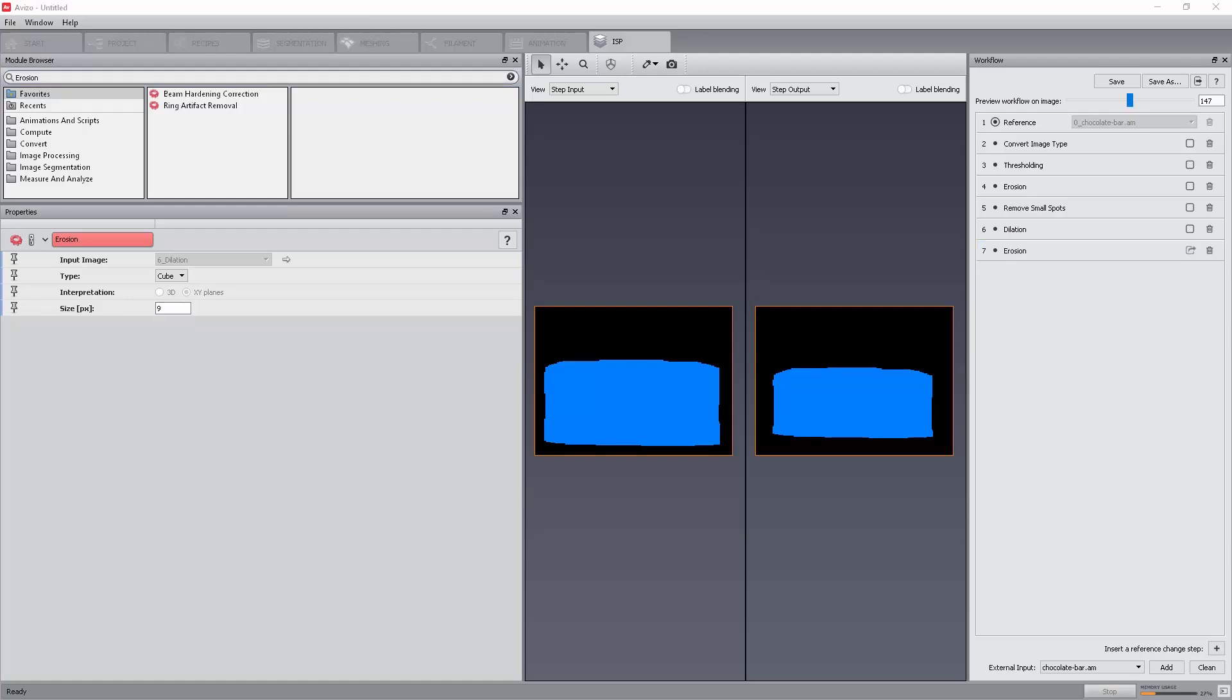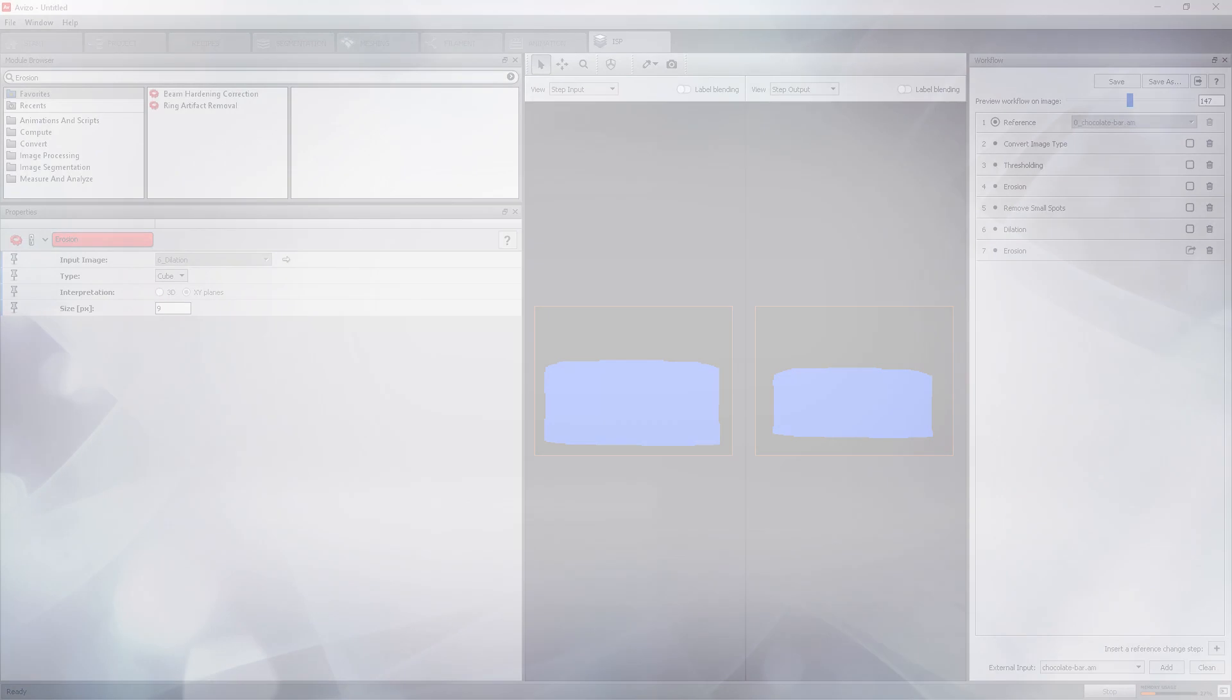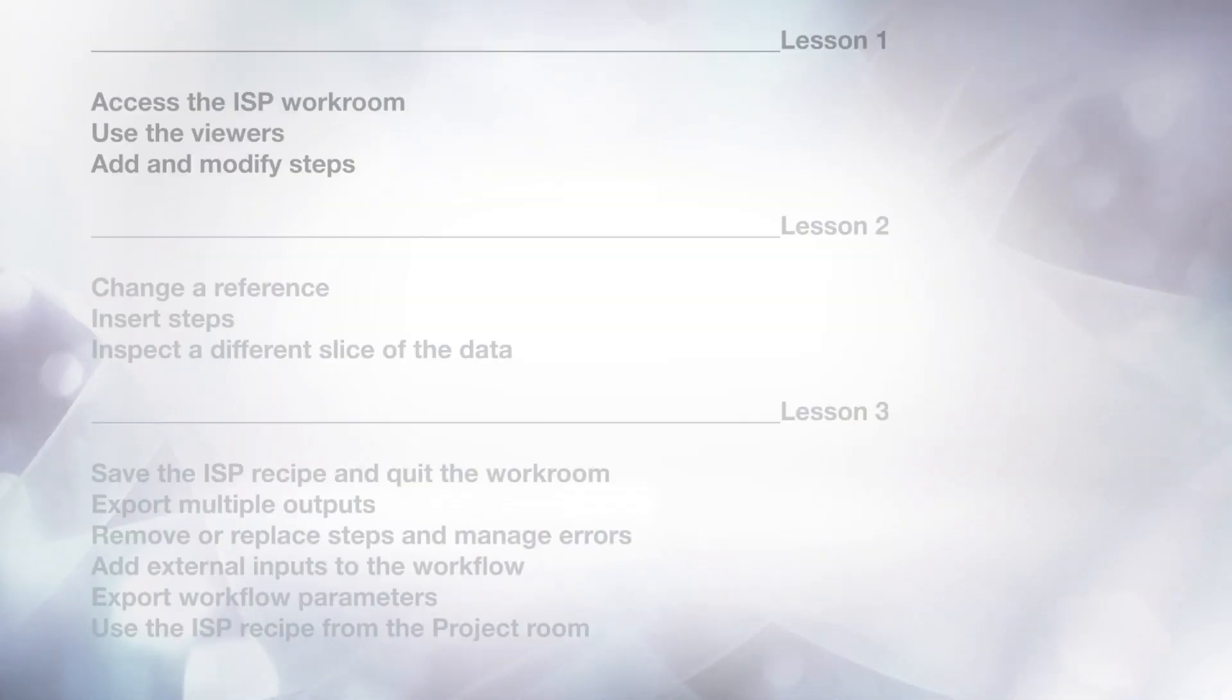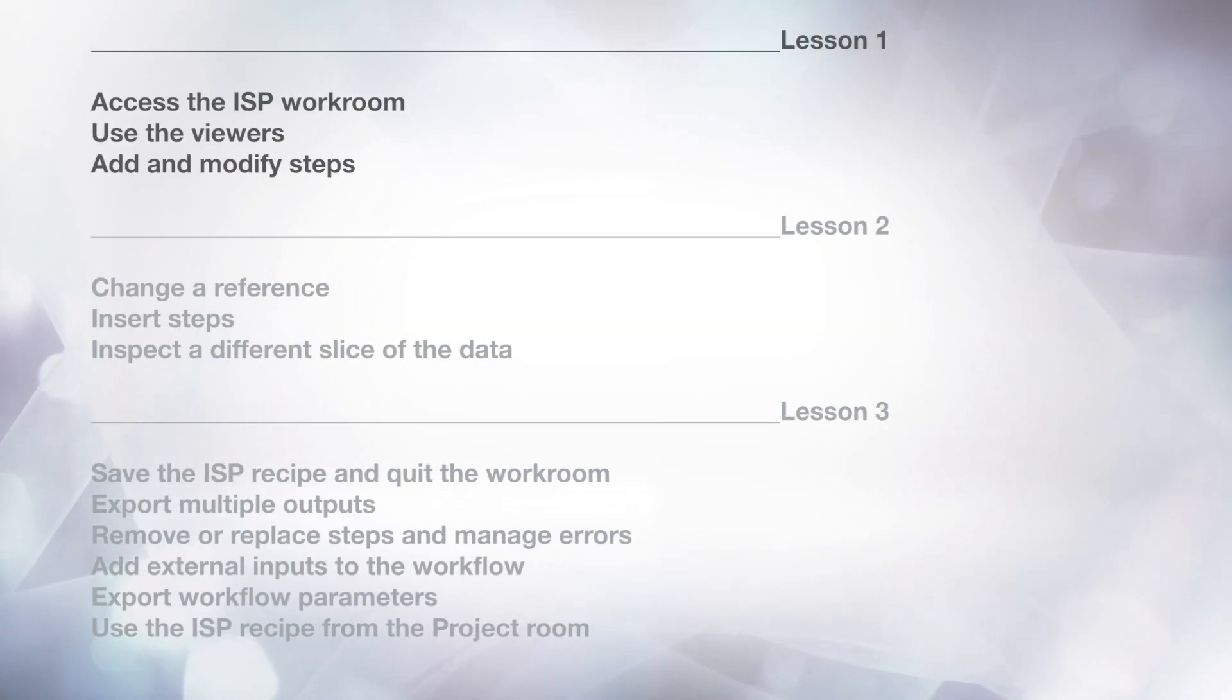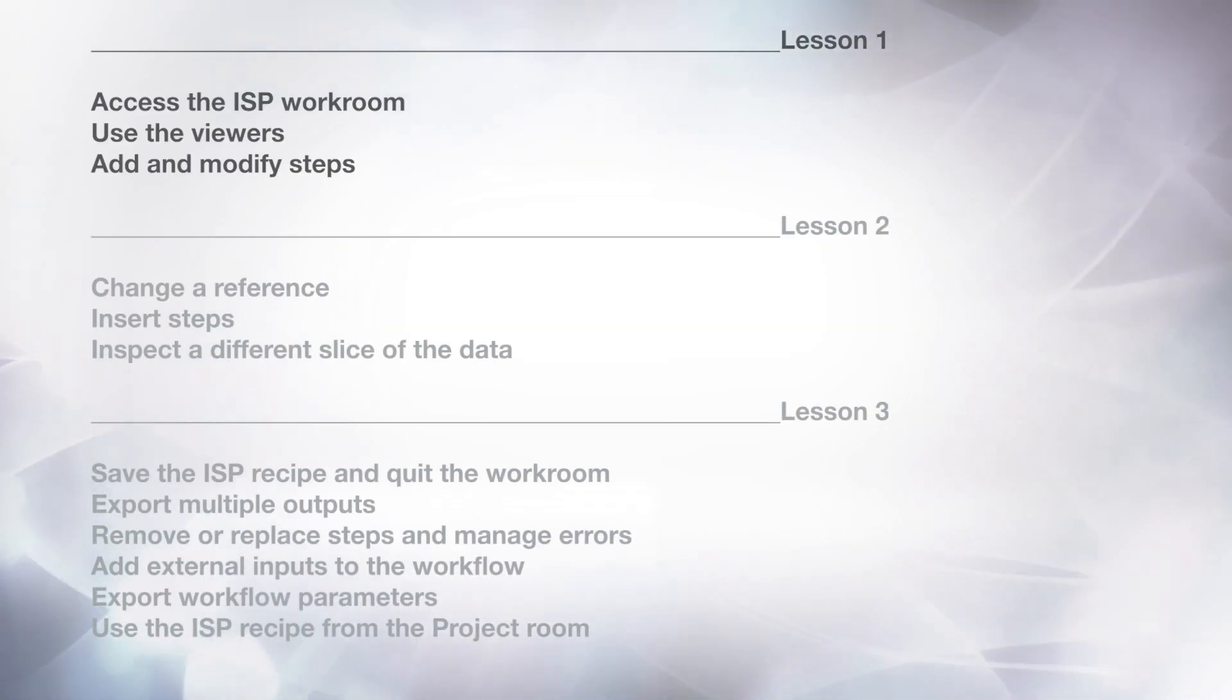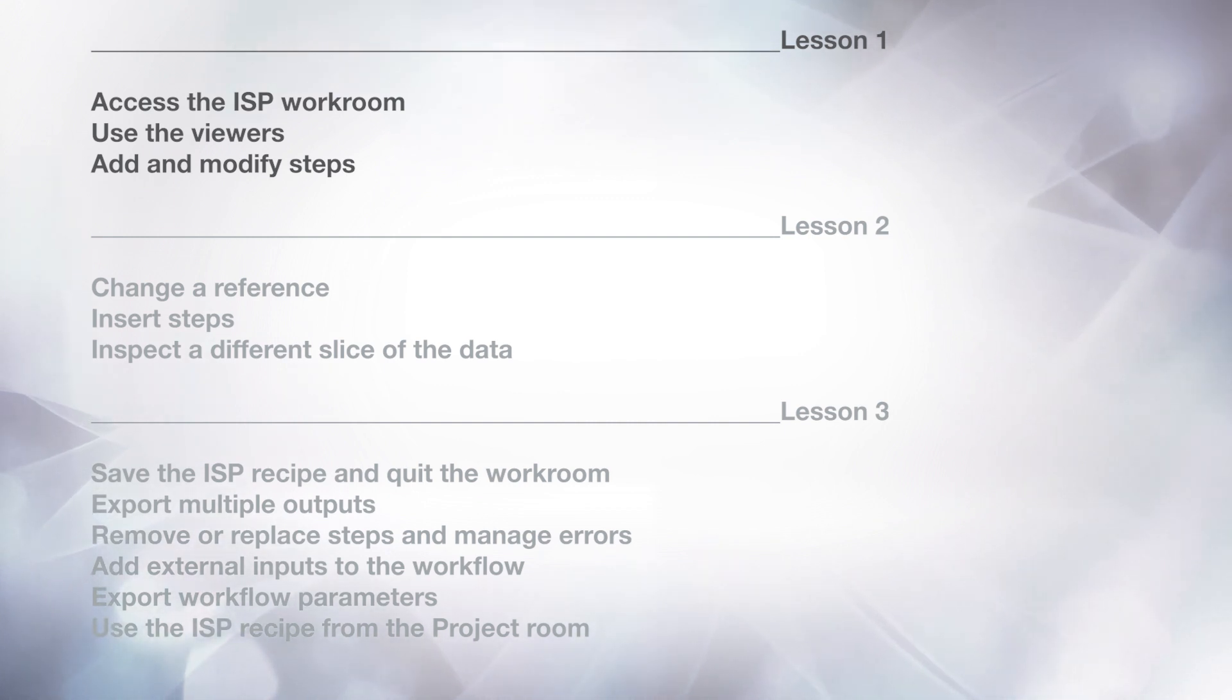Our mask is now ready. We will use it to segment the porosity within the Nougat phase in the next lesson. As a summary, in this lesson, you should have learned how to access the image stack processing workroom, use the viewers, add and modify steps.